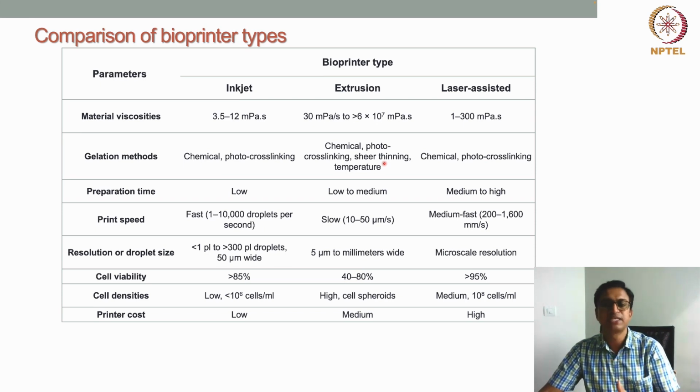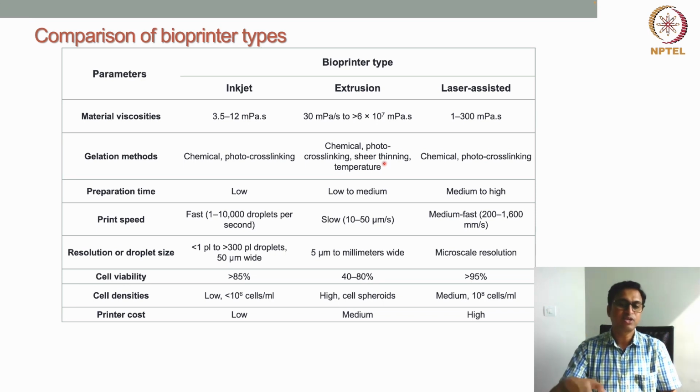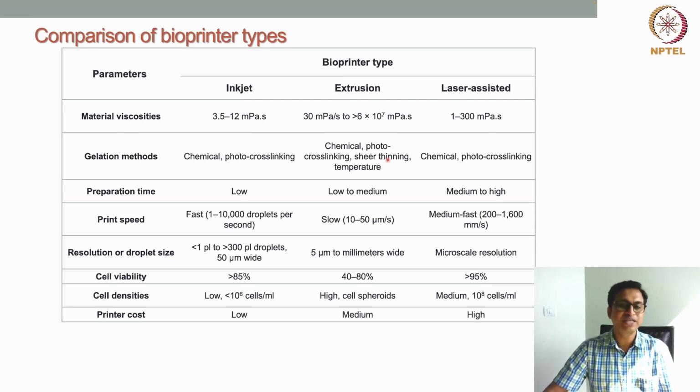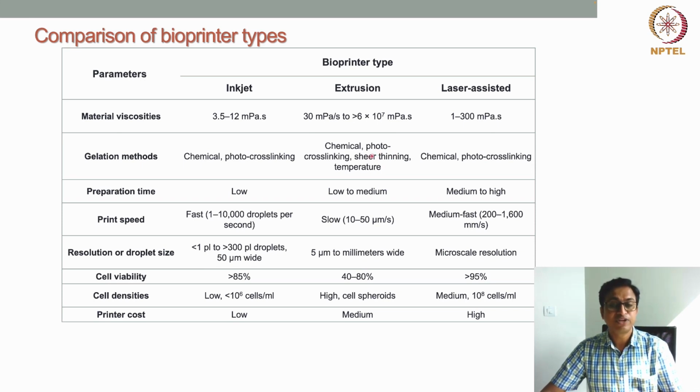So it helps in extruding the material. But when the material comes out of the nozzle, there is no shear force, so the viscosity again goes up. That helps in retention of the line and the structure in extrusion-based bioprinting. So shear thinning material definitely helps in better shape retention. That's why these materials are very popular and very good to be used as biomaterials for extrusion-based bioprinting.